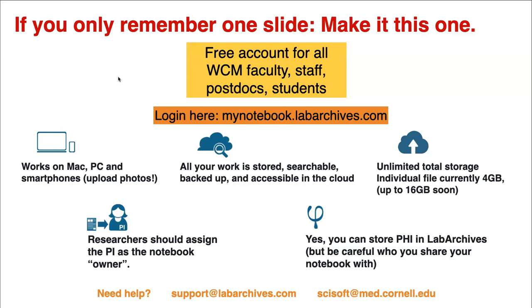Maybe it's a little bit difficult on the smartphone, but what the smartphone has, which is really useful, is you can connect the LabArchives software on your smartphone to the camera, and then you can take pictures of gels, take pictures of your lab notes, graphs, images, X-rays, everything.